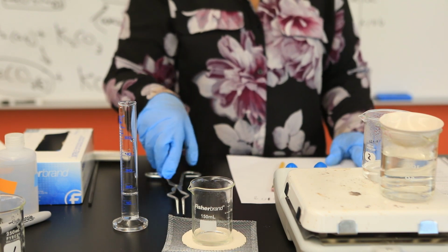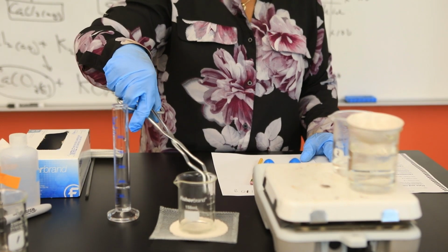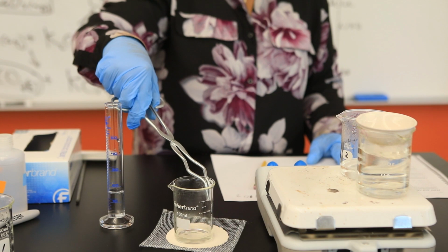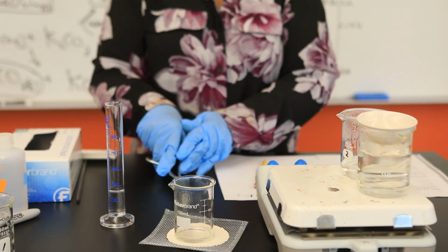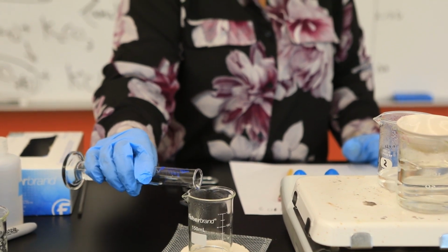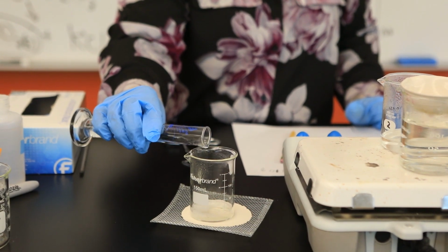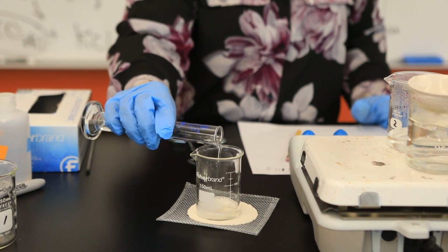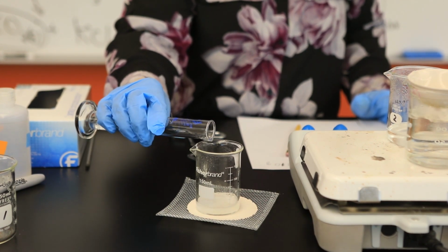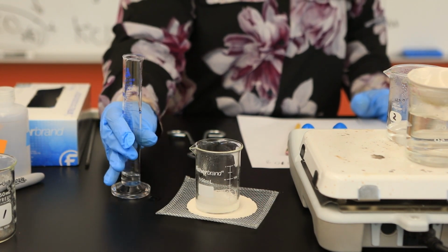I'm going to allow that to cool for a minute or two. I will avoid using my hands. And then I'll add our potassium carbonate solution. Now, what do you think should happen? So let's do this slowly. Adding that potassium carbonate should do what? Hopefully it will be the case, right? What are we going to do? We're going to hopefully recover that white solid, which is what? Calcium carbonate.